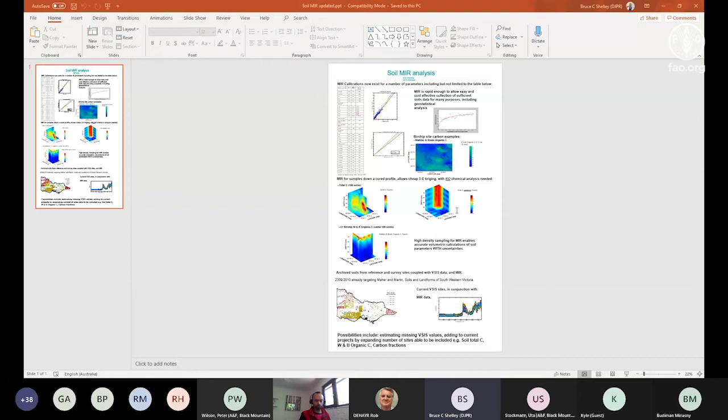Mentioned earlier, we're using MIR to measure the three critical inputs into PDFs for soil water function. That gives us better results than the prediction that we've already calibrated for with soil water function, which is on disturbed sample rather than the intact cores. But we've got a project going at the moment where I'm actually comparing the results because I've got samples from the intact cores as well as samples in the immediate area that have been prepared, so they're disturbed. We're going to compare those.